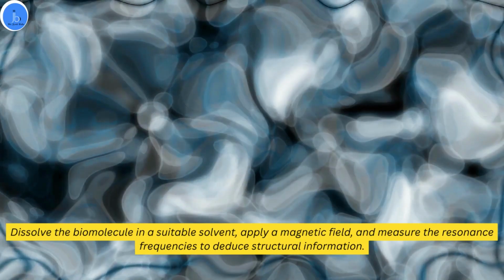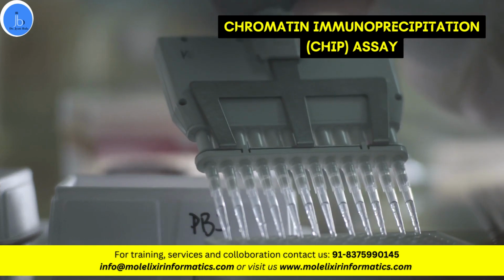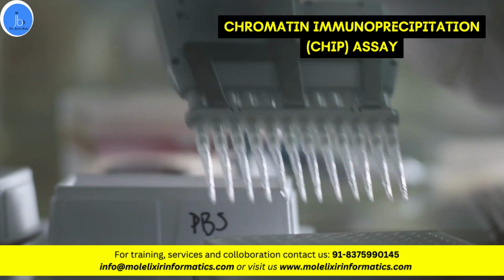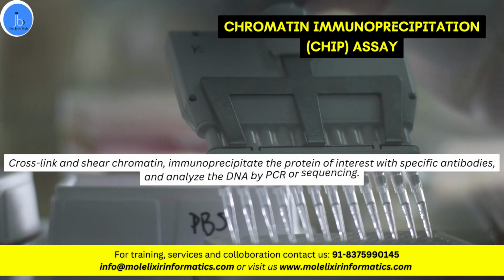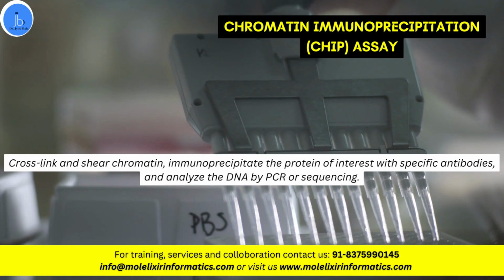Chromatin immunoprecipitation, the ChIP assay. This involves investigating the protein-DNA interaction and identifying the binding site of a specific protein on DNA. It involves cross-linking and shearing the chromatin, immunoprecipitating the protein of interest with the specific antibody, and analyzing the DNA by PCR or sequencing.